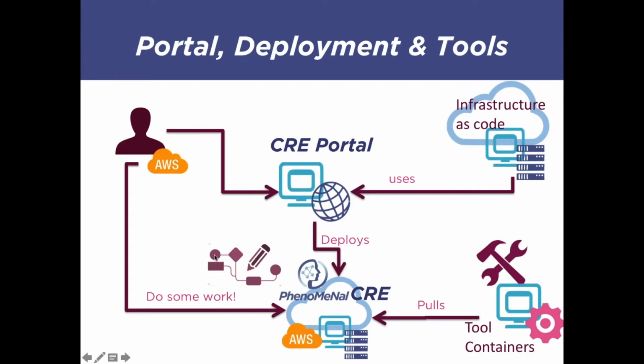And as the user starts to use these workflows and invoke different tools, the different tools get pulled into our cloud research environment. This means that the setup of this is relatively lightweight, and it takes in the region of 15 minutes or roughly that. But it's a lot faster than previous setups that were available before the era of using containers in the cloud.